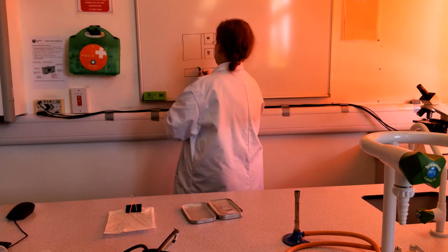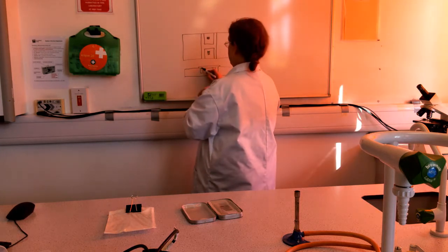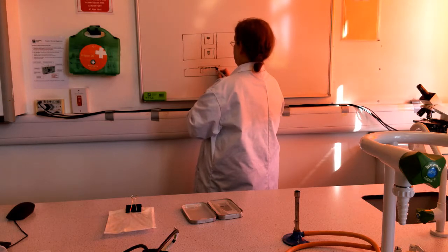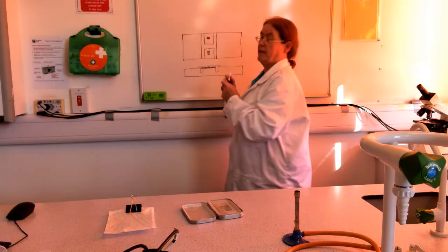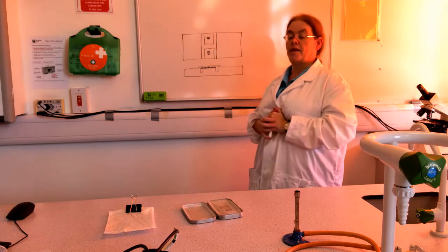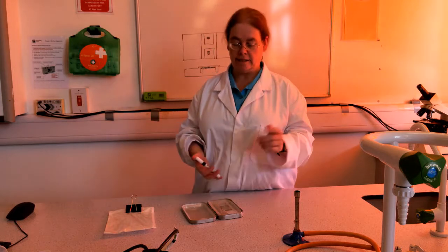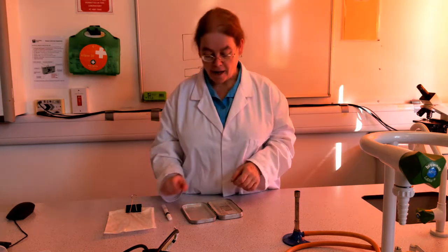So when you put the cover slip on here, there's like a space in there to put liquid in, where I've coloured in black. And that space is of a known volume. It's normally 0. I don't know what it is. It's written on the box.